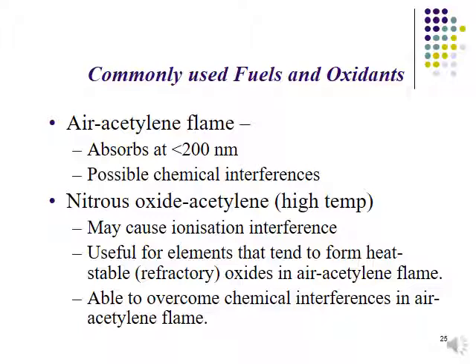Next, the nitrous oxide acetylene. So this is a higher temperature, and it may cause ionization interference. And next, it is useful for elements that tend to form heat stable refractory oxides.